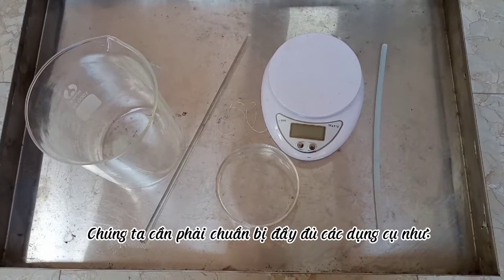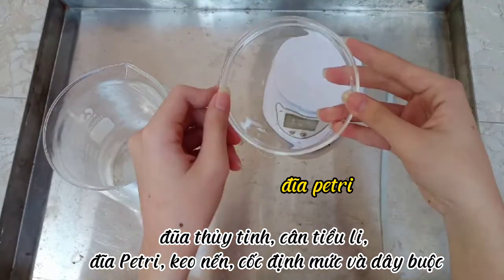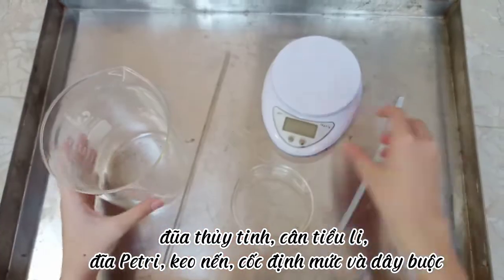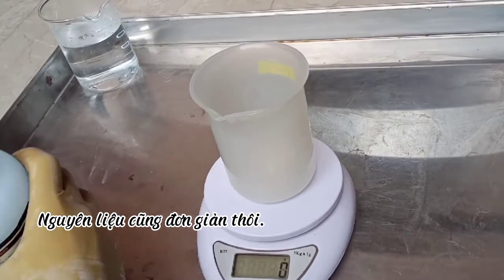We need to prepare a full range of tools such as a glass rod, a precision scale, a petri dish, a hot stick glue, a measuring cup, and a string. The ingredients are also simple.